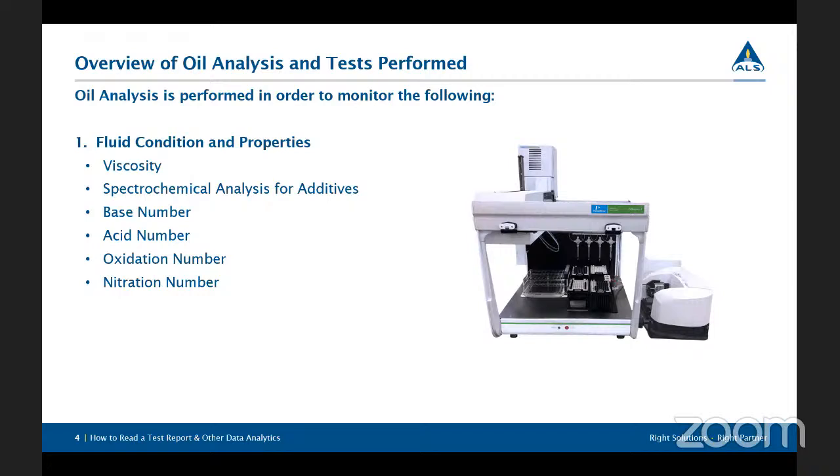And we want to perform tests to make sure that the condition of that fluid, the product itself, is okay, and that it still has the properties that it should have. One of the most important properties is viscosity. The true term for viscosity is its resistance to flow, but in layman's terms, it's how thick is that fluid. You can think about honey being very thick and water being very thin. They have two very different viscosities. And so we want to test that and make sure that it falls within its specification. And there's ISO specifications and SAE specifications depending on the fluid application.